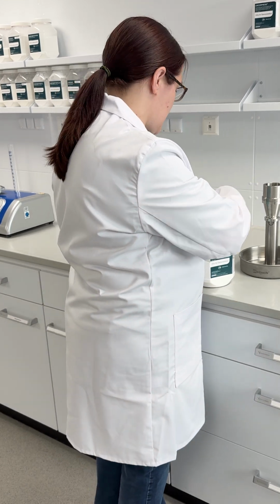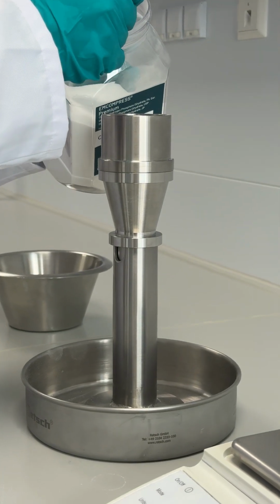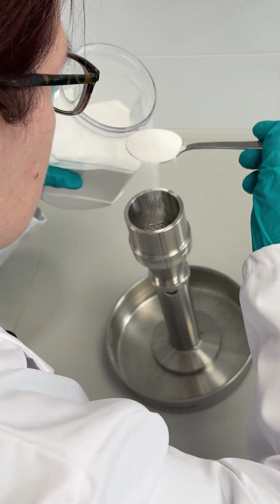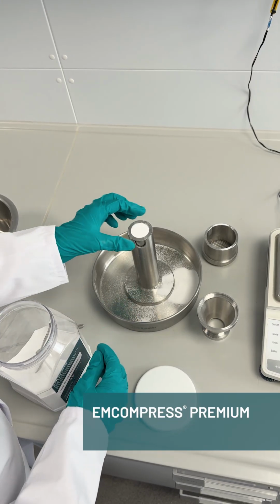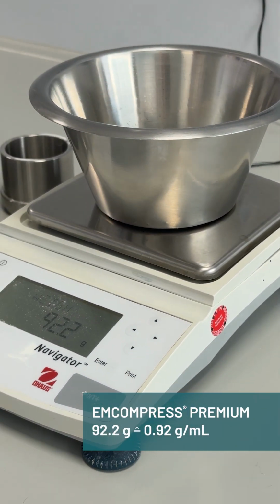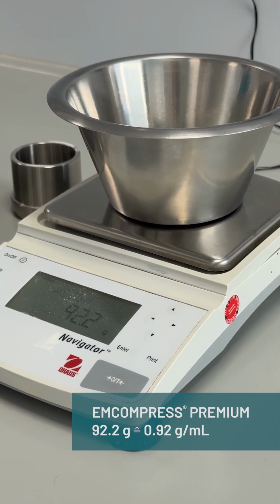So here I've got a cylinder of a known volume, 100 milliliters, and I'm going to fill that cylinder through a mesh to break up any clumps, and then ensure that it is full. Okay, so now it's going to be weighed into a container, and we can see that there are 92.2 grams in 100 mils, so that gives a density of 0.92 grams per milliliter.